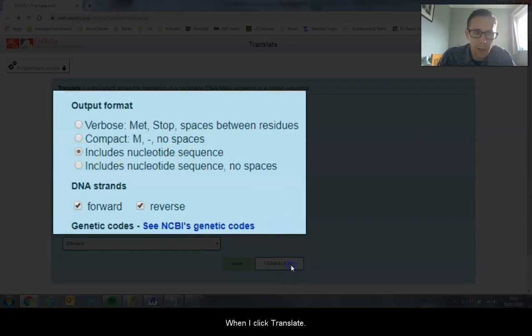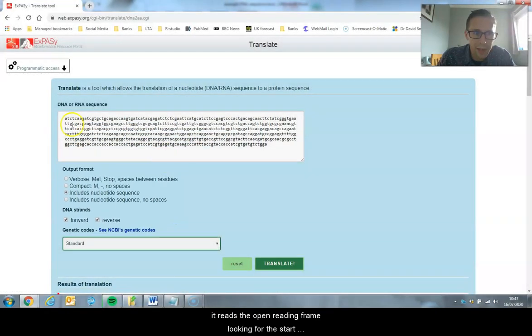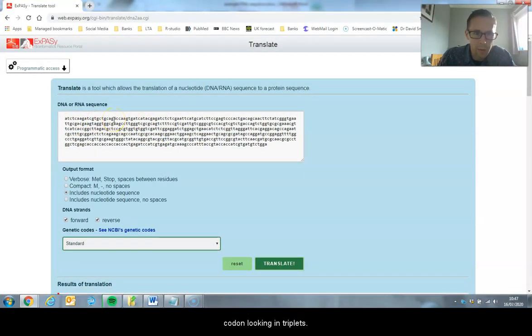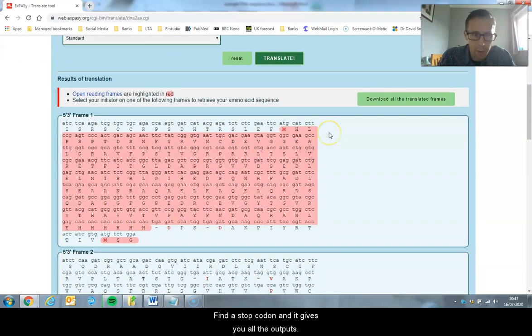When I click Translate, the tool reads the open reading frame looking for the start codon, looking in triplets until it finds a stop codon. It then gives you all the outputs below.